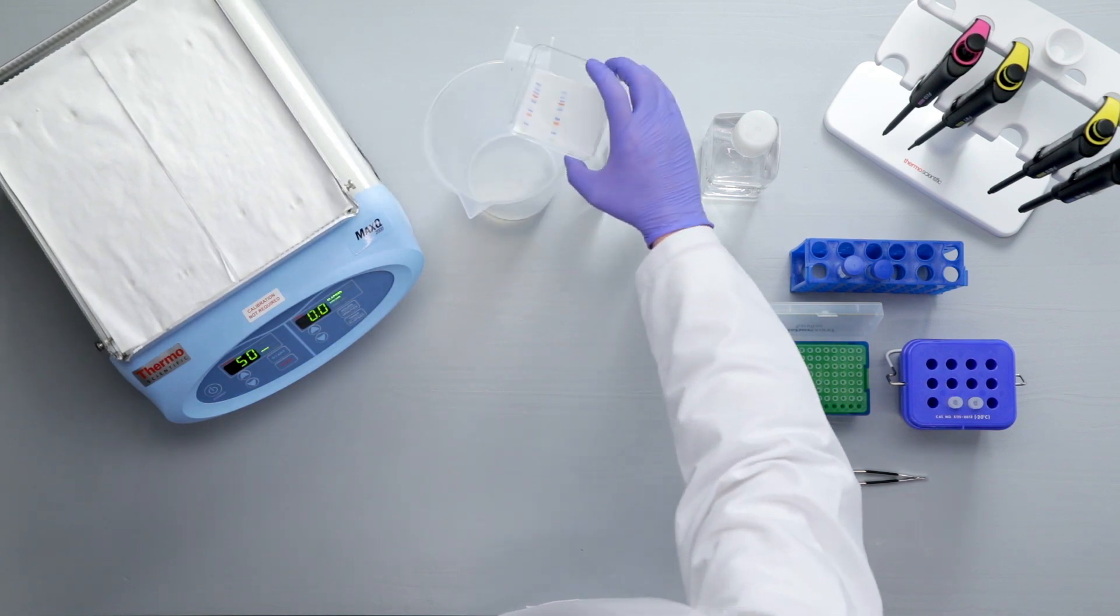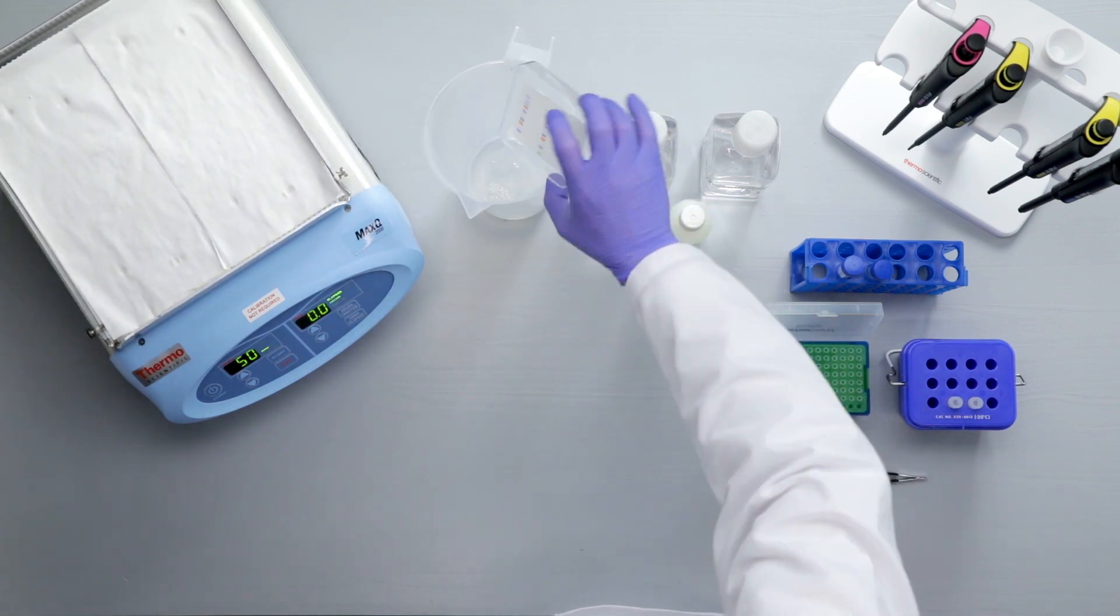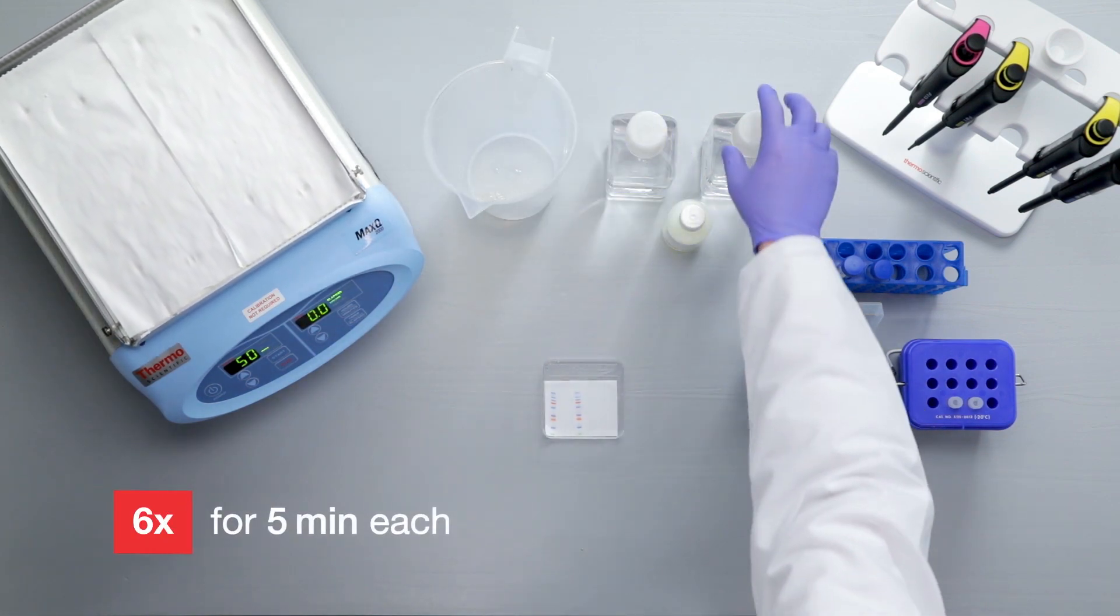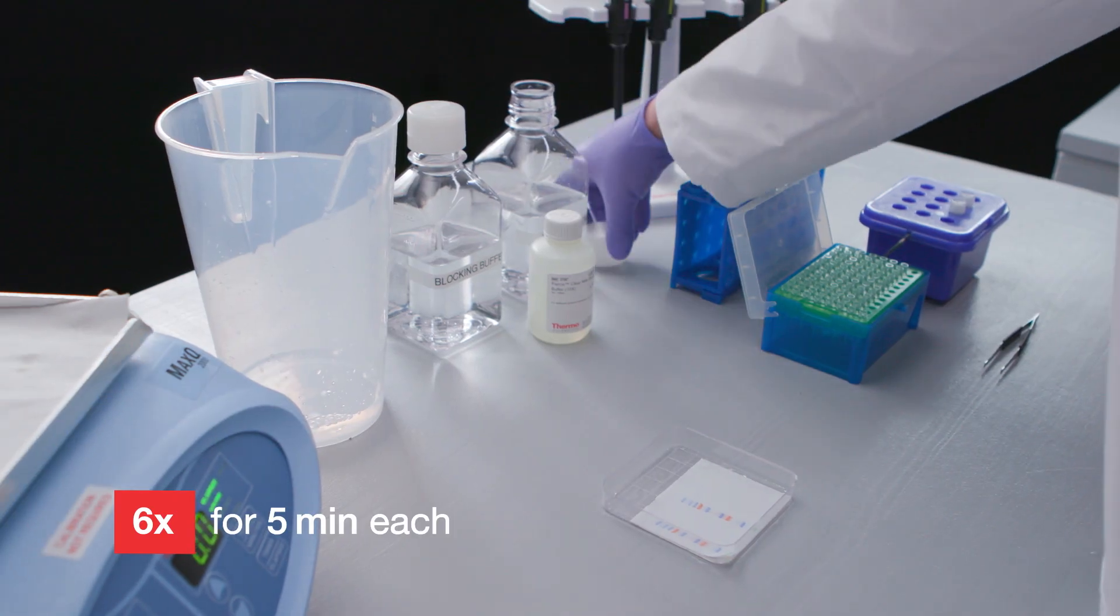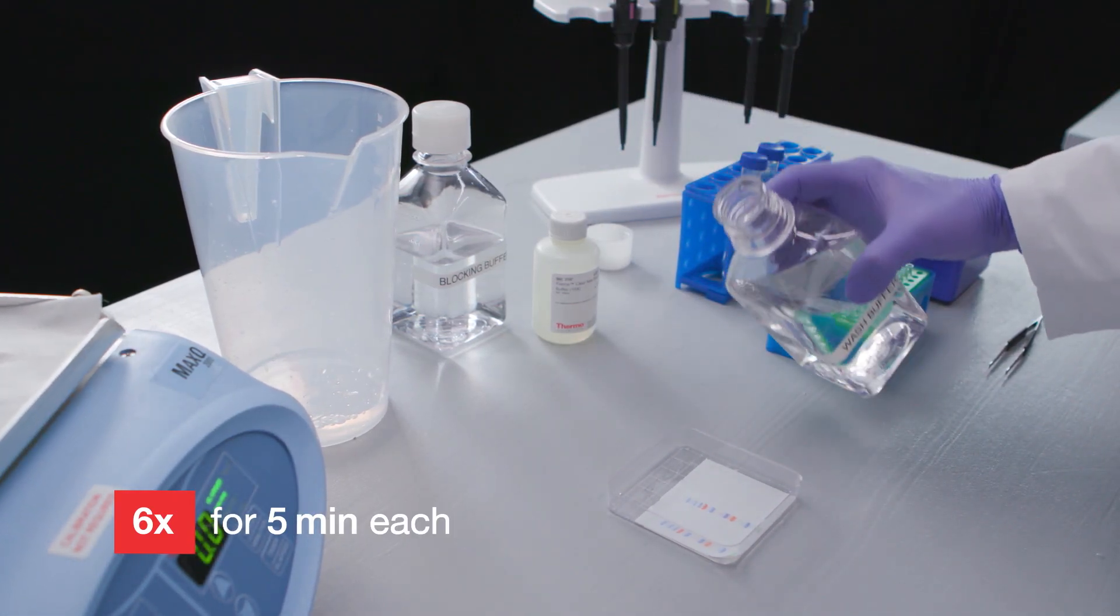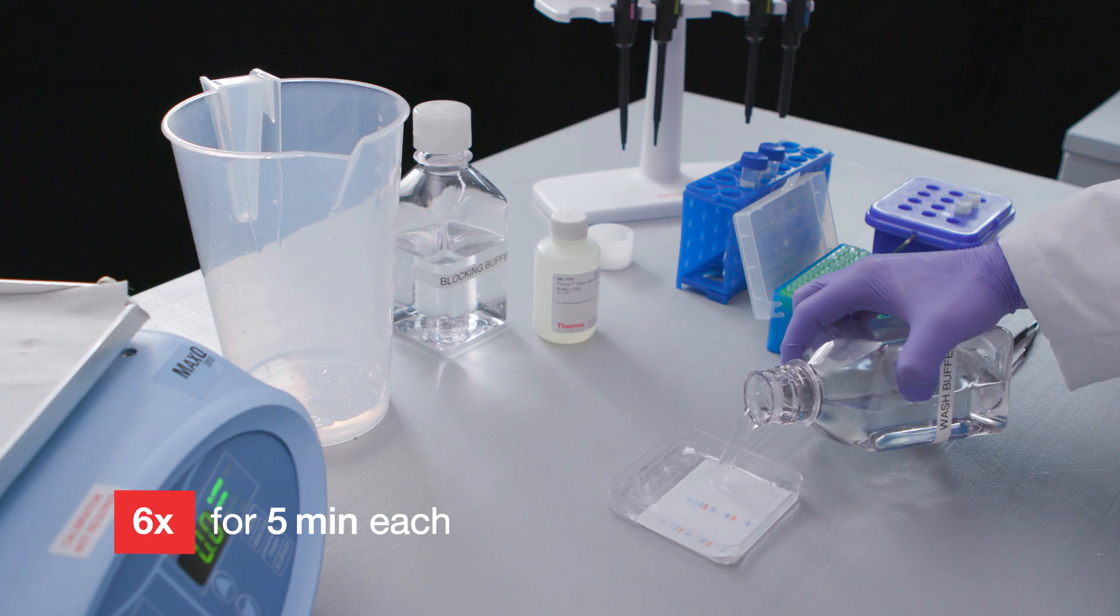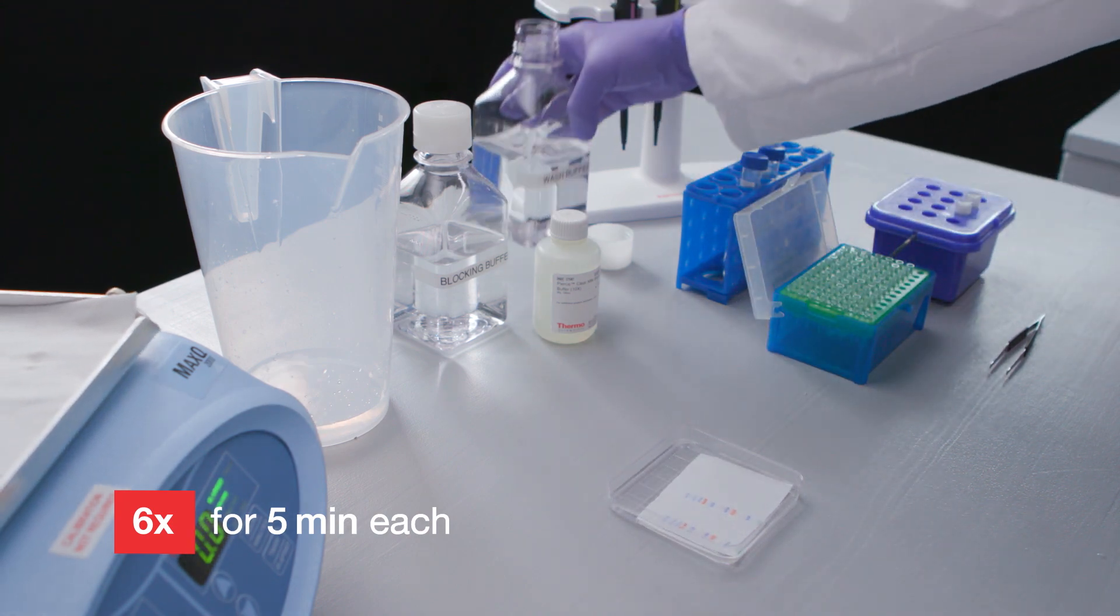Remove any unbound secondary antibody by performing a series of washes. Wash the membrane 6 times for 5 minutes each in wash buffer with gentle agitation. Washing at this step is important to help limit background signal.